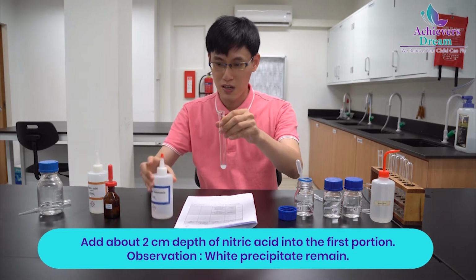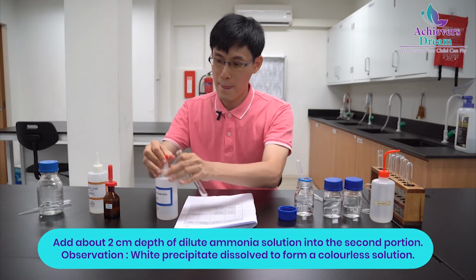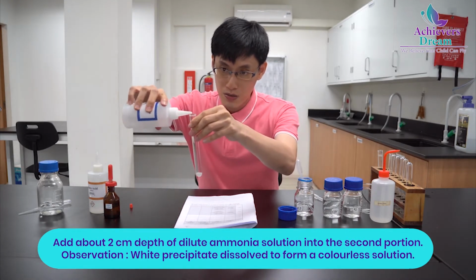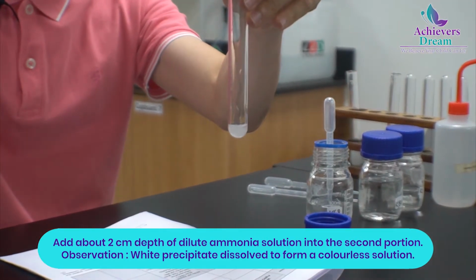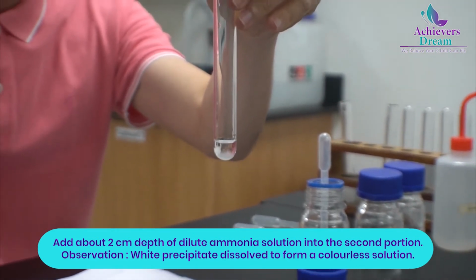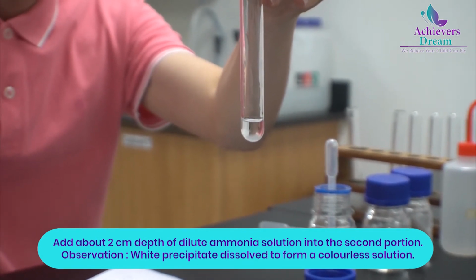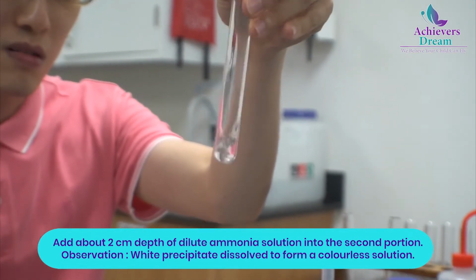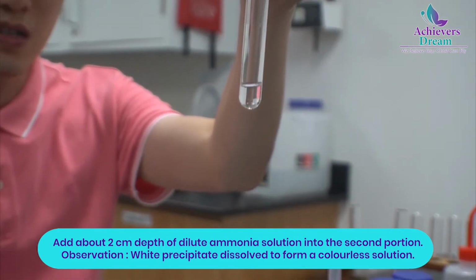Let's try ammonia now. Let's see what happens. Okay, so here goes. Let's see whether the precipitate dissolves. Ammonia is going in. You can see that some precipitate is already dissolving. You see it? Some precipitate is dissolving. More is dissolving. And the precipitate is gone. Look, the solution is clear.